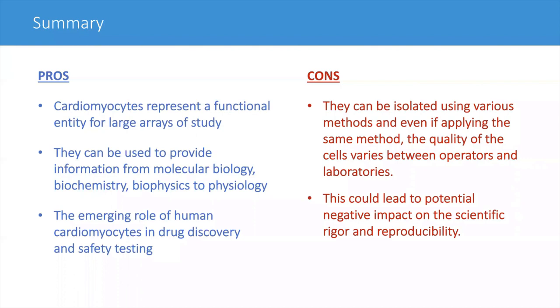In summary, the isolated cardiomyocyte is a powerful tool to advance our understanding of cellular biology, biophysical properties, etc., at the single cell level. Moreover, since cardiomyocytes not only can be isolated from animal models, they can also be isolated from explanted human hearts. However, it is also important that we provide the highest standard and consistent protocol and quality control within a lab, as well as among laboratories.